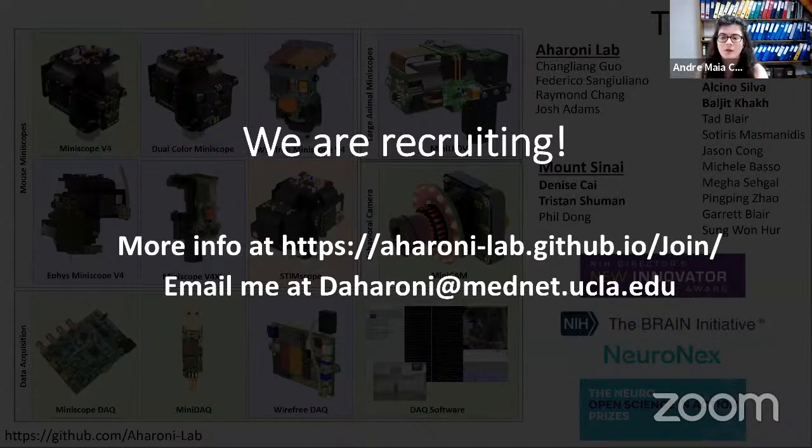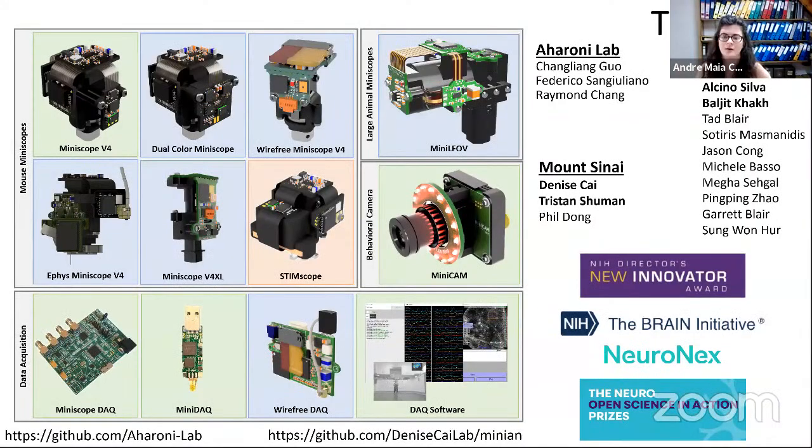Thanks. So I was wondering about the weight. You mentioned all these larger systems, but for the lowest ones, you were down to 3.3 grams. For songbirds, we work with a max of around 10% body weight, 2.5 grams. What can be done there to reduce the weight, or have you tried with songbirds?